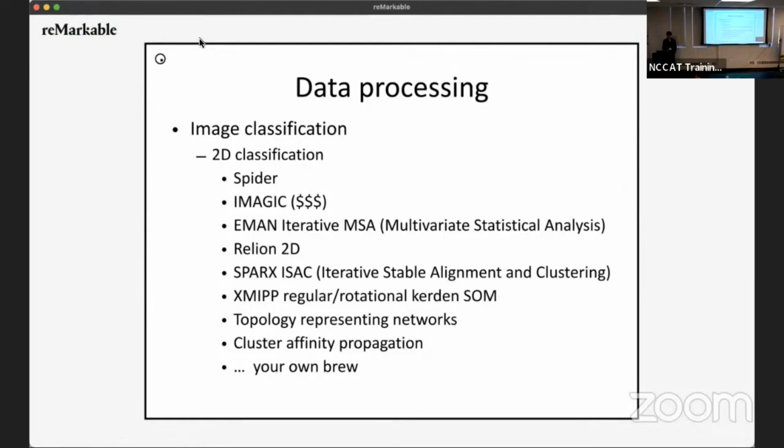or they might show low resolution, so you might say, oh, that's a low resolution view, where the reason is that maybe there are very few particles in it. So 2D classification is very dangerous for removing things. I tend to use it to remove gold edges or things that definitely have nothing to do with the particle, and I'm 100% sure about it, but I tend to keep everything that I'm not sure about.